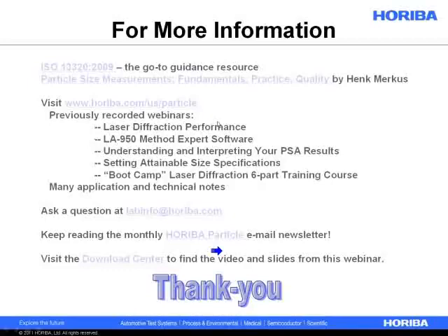Again, I apologize if I mispronounce, but Gabriel asks if I put the wrong refractive index, will it much affect the result? It will affect the accuracy of the result if your material is less than about 20 microns, because that's when the refraction of light through the particle becomes very significant, and that's where Mie scattering theory really differentiates itself from the Fraunhofer approximation. So if your material is less than about 20 microns, yeah, the refractive index is something you should care about if you care about accuracy of the result.